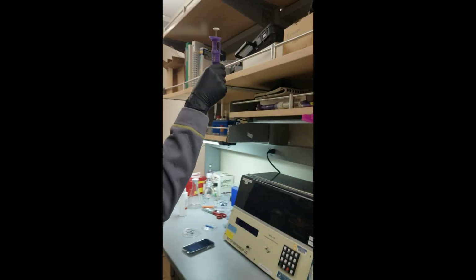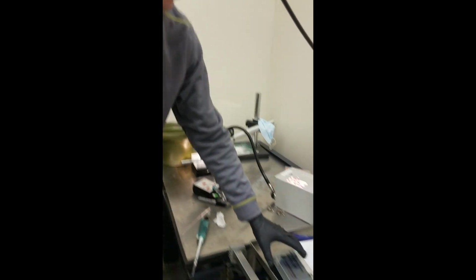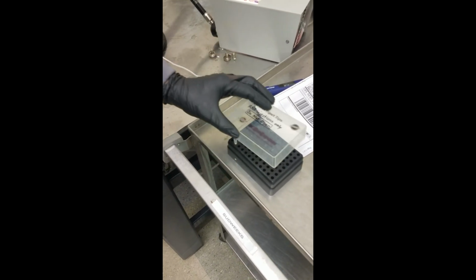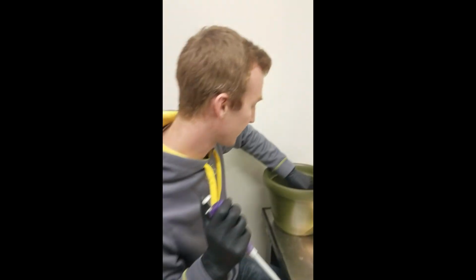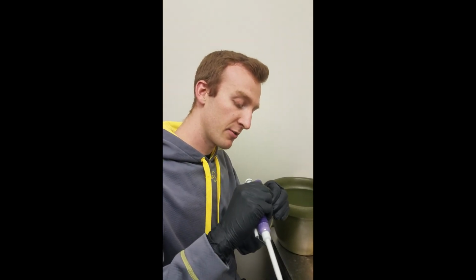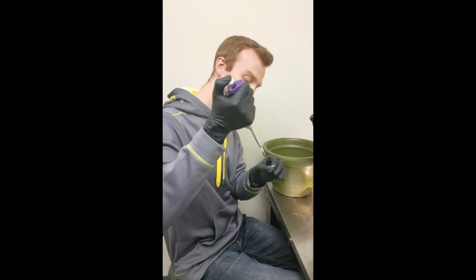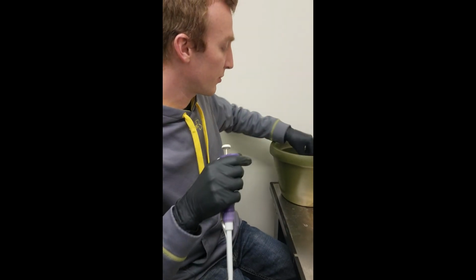You have your micropipetter. Here we have the micropipetter tips that are specifically for RNA injections. You want those the least exposed possible. Make sure the tip of your pipette doesn't touch anything. If it gets contaminated, then you have to redo it. Draw up the RNA. Place the cap, put it back in the ice.